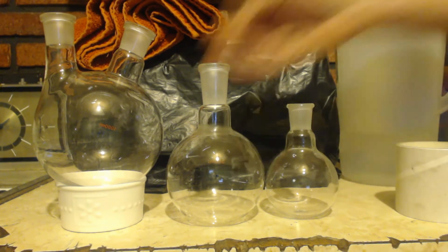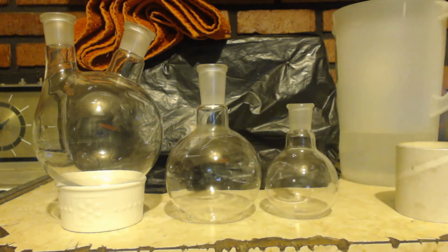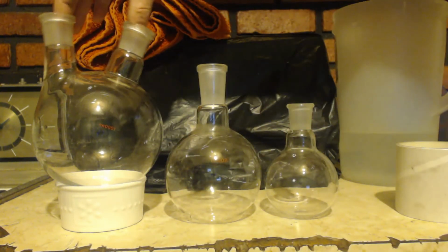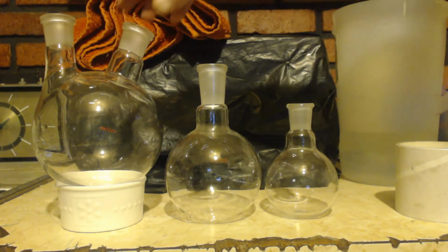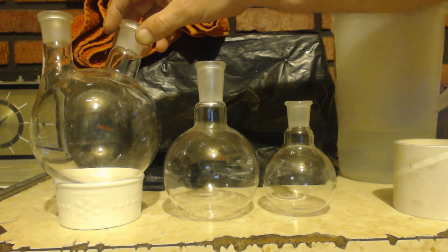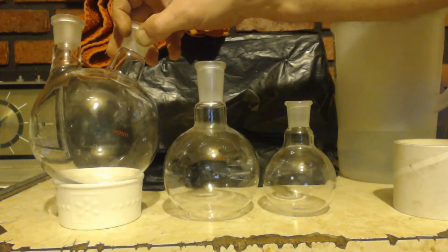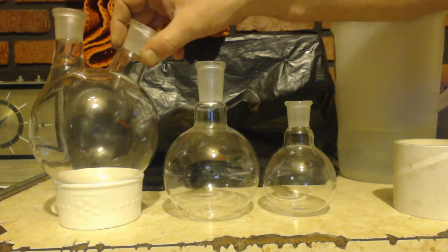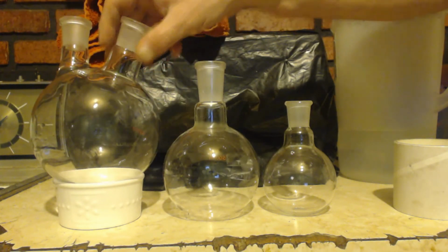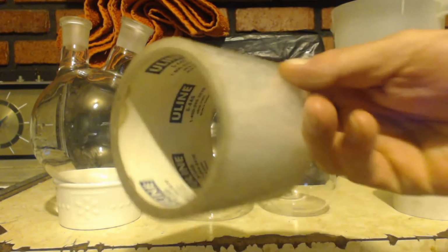But a suggestion, you could use these porcelain or glass bowls like this. The thing about those, though, especially if you have more than one neck, is sometimes if you're walking or something jumps and vibrates the house or whatever, these sometimes will fall over. Or given enough time, little vibrations will get it to move. So I don't suggest you use those. A good suggestion is tape.